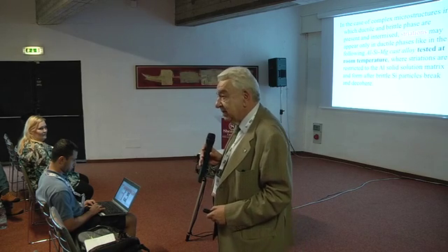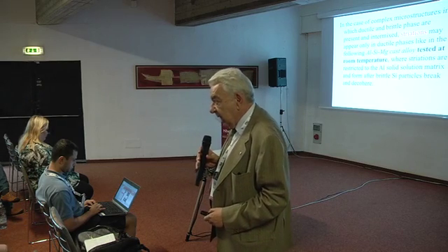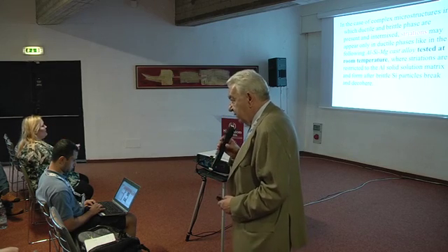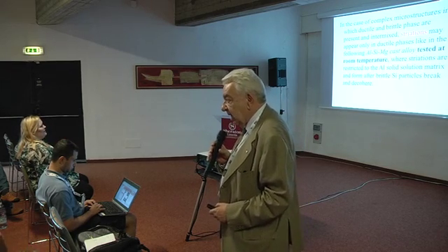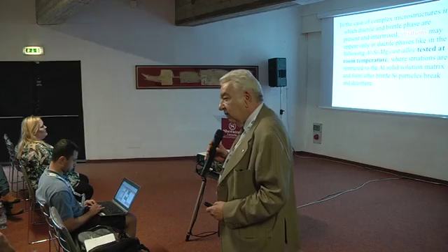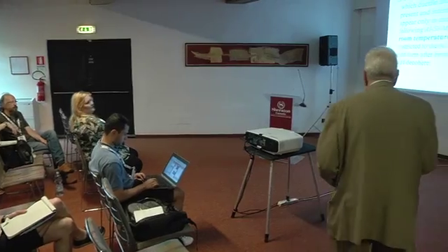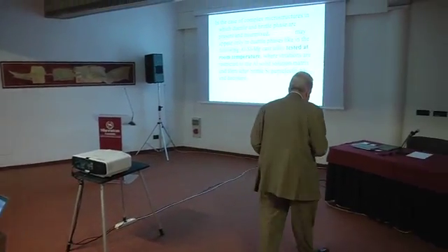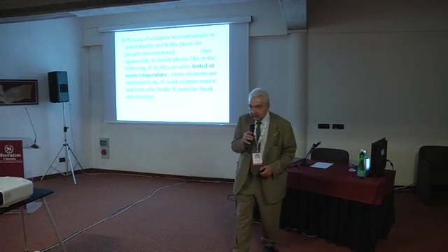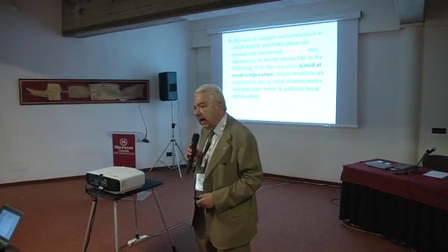that striations sometimes are very difficult to be seen. And I will present here a few cases, a couple of cases, in which acknowledgement of the existence of striations is difficult. And this happens when you have complex microstructures in which you have alternating brittle and ductile phases.